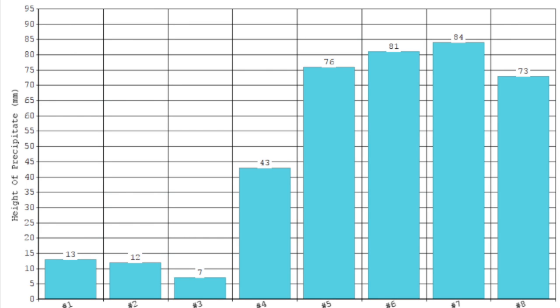In conclusion, after recording our data, we witnessed an increase in precipitation levels until test tube 5, where it proceeded to level out. We came to the conclusion that the KOH was a limiting reactant in the first 4 test tubes, as precipitation levels increased until the precipitate generally leveled out. The limiting reactant switched to CuSO4.